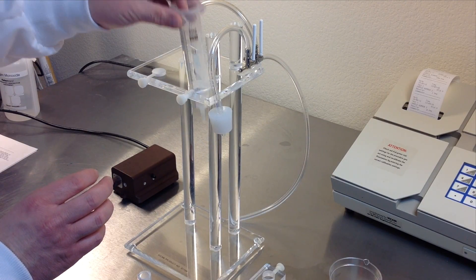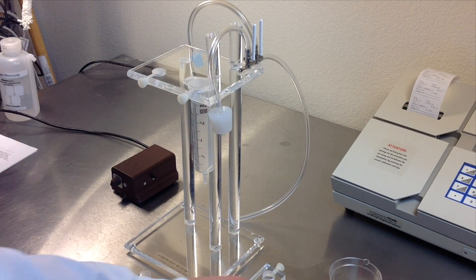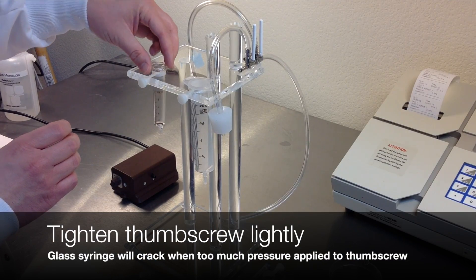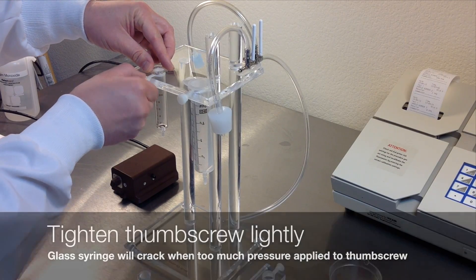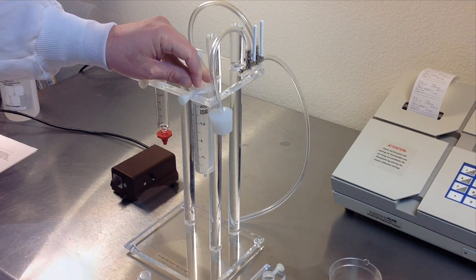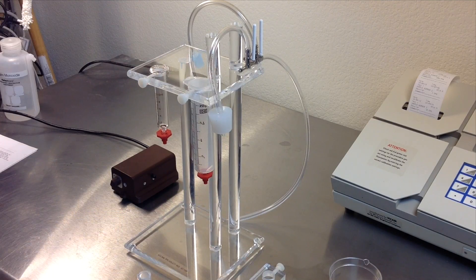Remove and dispose of the plunger from the plastic syringe. Place the plastic syringe in the right pump stand hole and lightly tighten with a thumb screw. Place the glass syringe in the left pump stand hole — this is glass — and carefully tighten the thumb screw. Add the red column coupler to the bottom of the syringes, and remove the bottom cap of the plastic syringe if you haven't already.